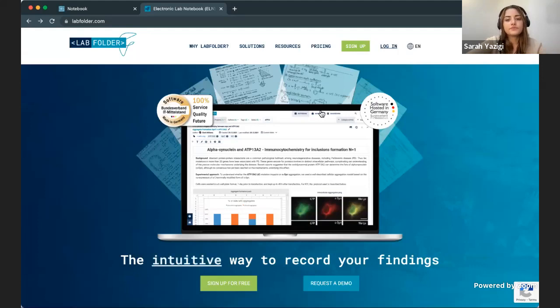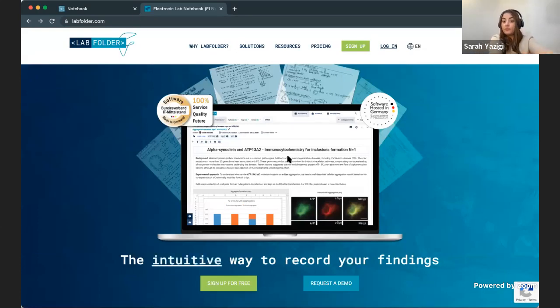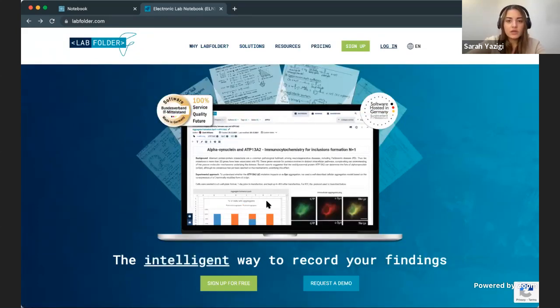So I will start with sharing my screen. You can already see it, right? As you may know, Labfolder is a web-based software. This means to access it, you go to labfolder.com and you will end up on this page.